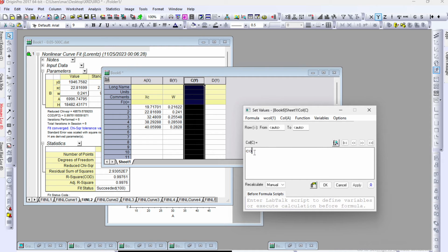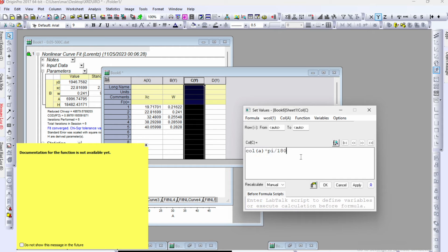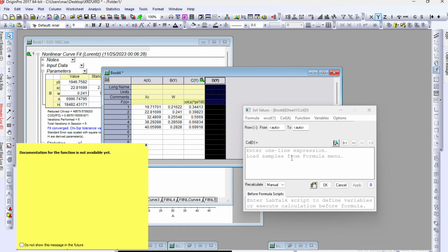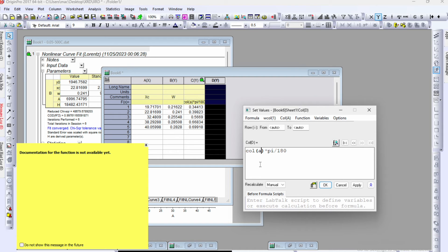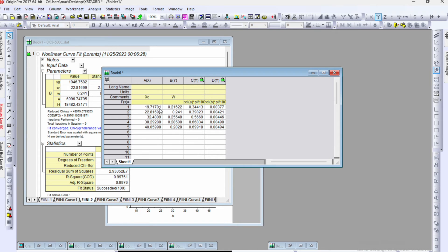Select column C, right-click, and go to Set Column Values. Define the function: column C equals column A times pi divided by 180 (converting degrees to radians). Copy and apply. Move to column D and paste the same formula but replace column A with column B (for the width): column B times pi divided by 180. Apply. The values are now converted from degrees to radians.